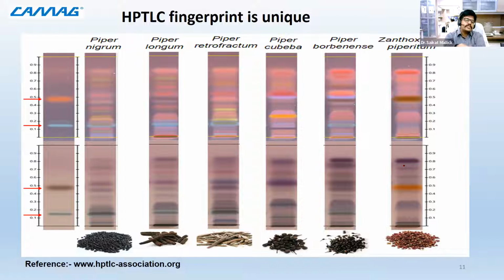and thereby now you can take a call on which sample should be my objective to do the bioautography studies, whether I should go in for the raw material, because raw material has the compound, it will definitely show. But when you are making a formulation, whether the formulation is also having the capacity to show the activity, maybe antioxidant activity. You have a cream, maybe some popular cream in the market, and you want to see that it is giving you a good antioxidant activity. L'Oreal and so many brands are there, and there will be ladies who are using this, even gents, they are using it for detanning themselves.